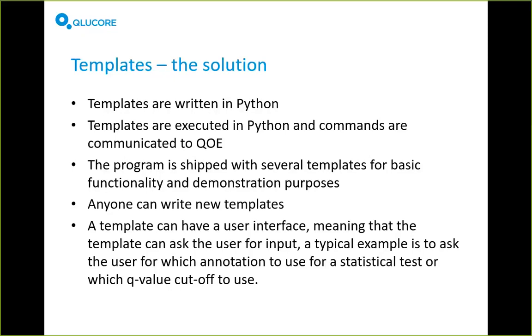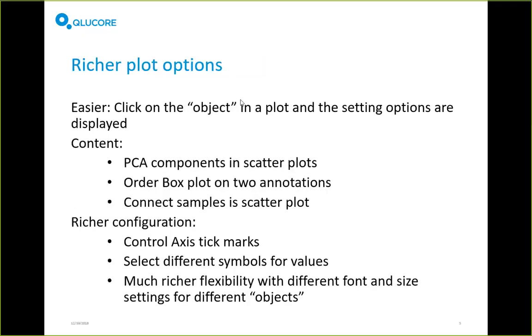But there's plenty more in this release, and there's a few things I want to highlight before I show you the demonstration today. One of them is the rich plot options, because one piece of feedback that we've gotten from several customers is that you have regulations from your publications that a plot is supposed to look a certain way or use a certain font and so on.